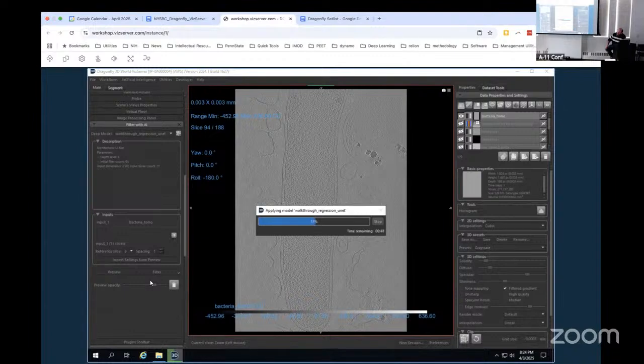It's like you give it a batch that you train with, and then if you want, you get more. Okay, from a similar setting. You just retrain the network? I think after it trains with a subset of like 10, it'll spit out a denoised version of those, and then you can also get more new ones, and it'll spit those out. I know it will. I just wonder how good it is at it. For me, they're tomograms I collected in the same session. I bet if they're in the same session, it would probably do all right, yeah.